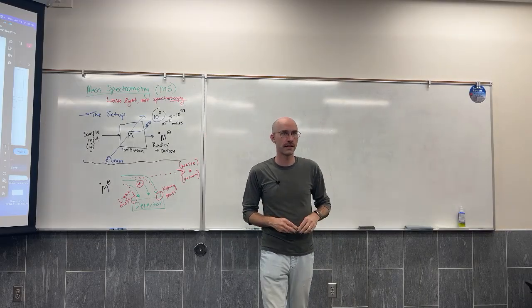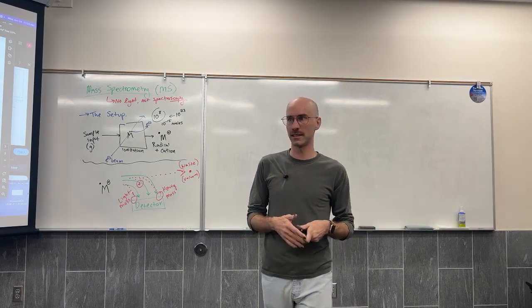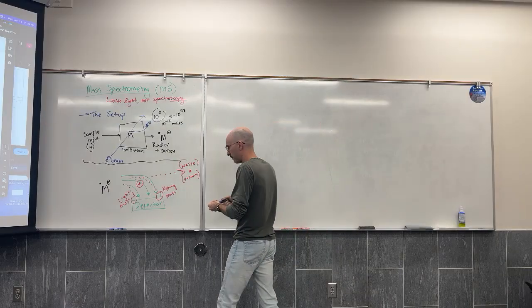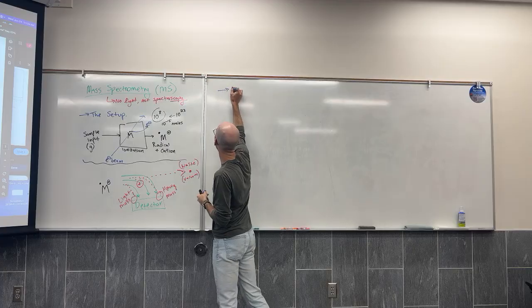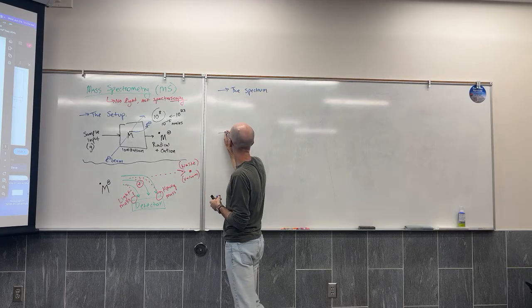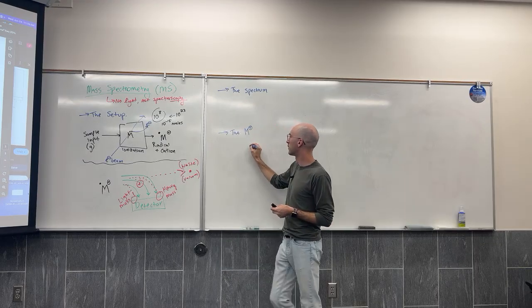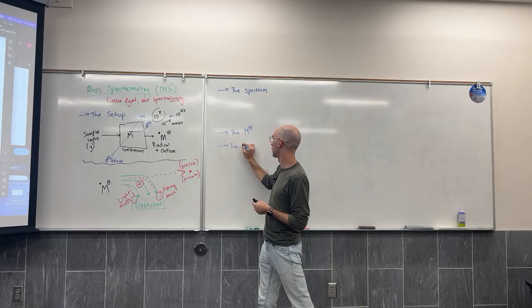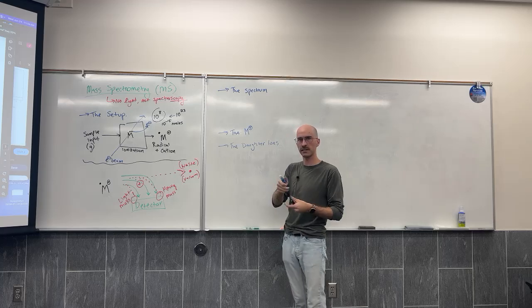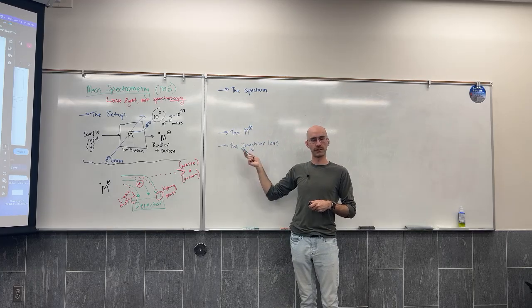All right, I've got 30 seconds, and I'm not going to try to explain all of the little details. What we're going to look at tomorrow is, well, first of all, we always look at the spectrum. So we'll look at what the spectrum looks like and how we analyze it. We're going to look at the molecular ion, and then we're going to look at the daughter ions. Or as we said in lab yesterday, the mother ion, as opposed to the molecular ion versus the daughter ions.